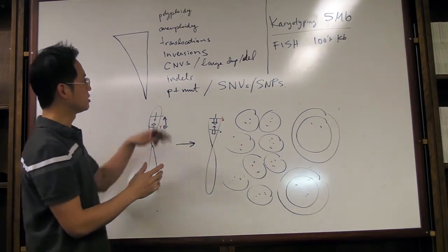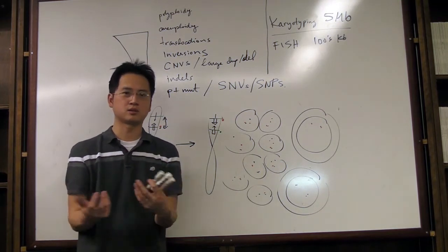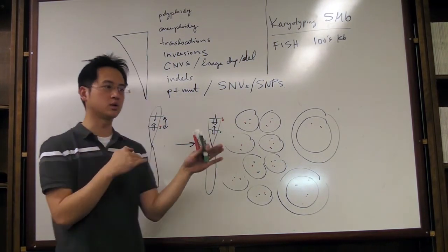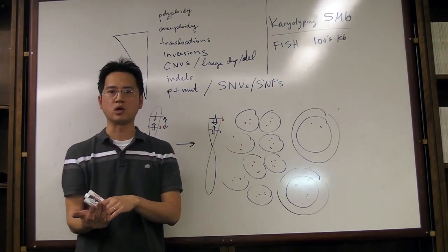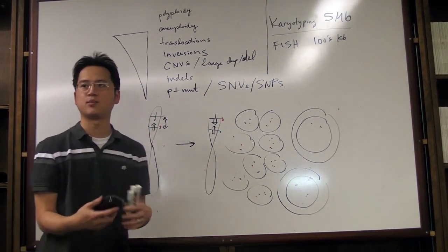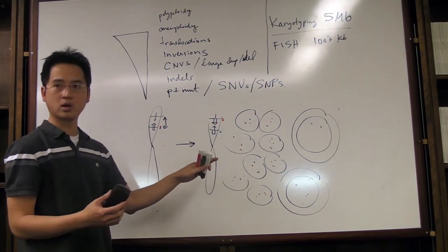So I won't get too much into the details of how to score because I think that's more for an interpretive sort of session. But there are certain thresholds that you would draw if you're doing copy number versus rearrangements to call something positive. There's sectioning artifacts, for example, so that's why you built that into the assay. But otherwise, this is a summary of FISH.